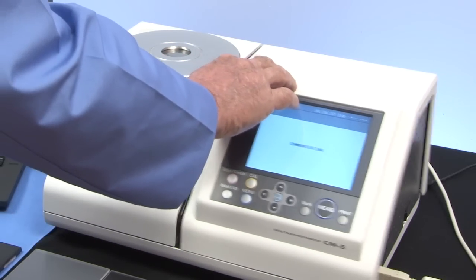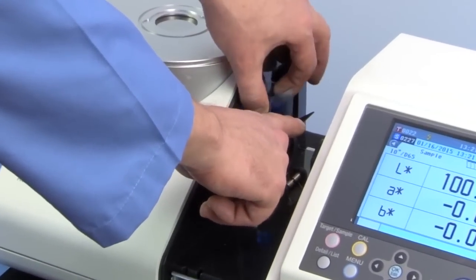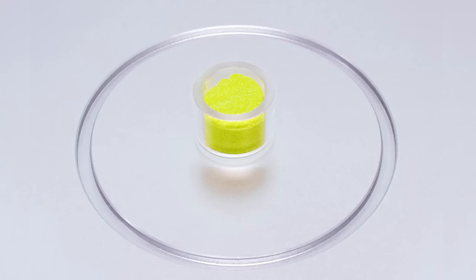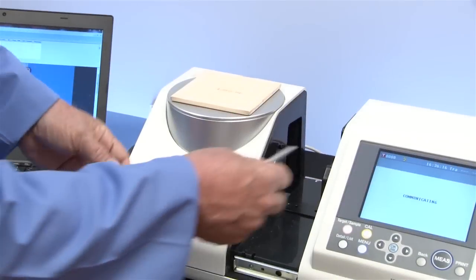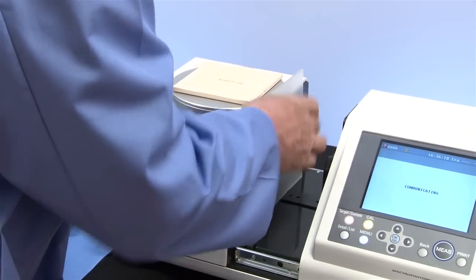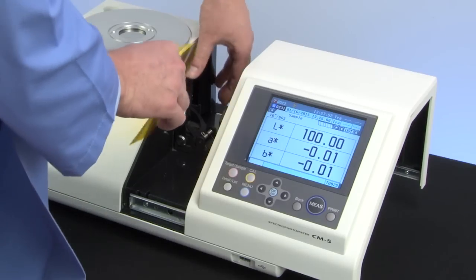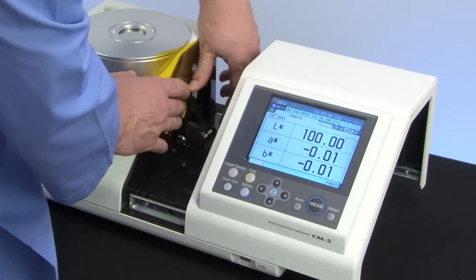The CM5 measures a variety of samples with different material characteristics such as liquids, powders, paste and granules, as well as the haze of transparent films and glass. The transmittance chamber can hold large sheets up to 60 mm thick.